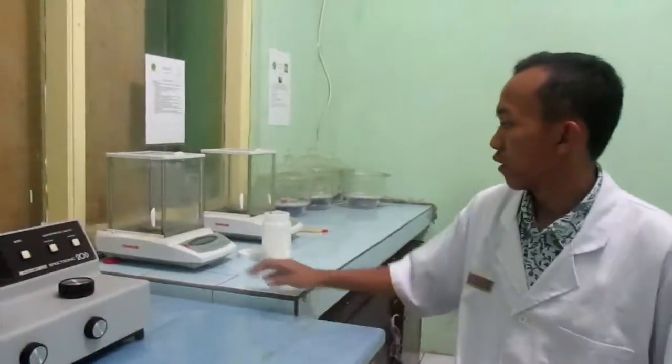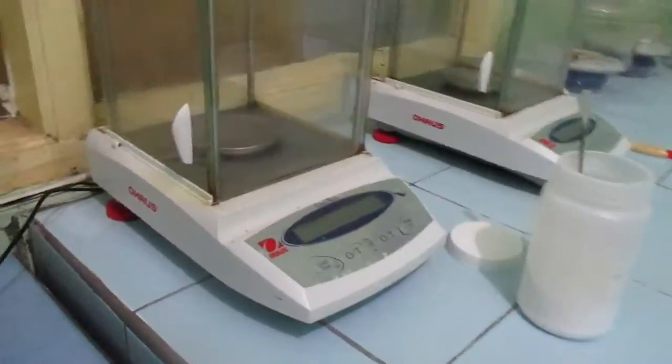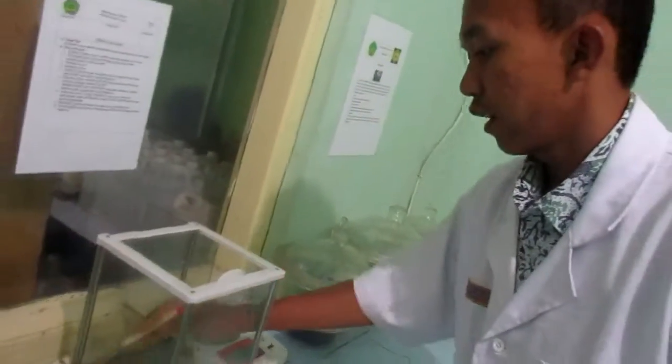In many experiments that you do, there will be a requirement to weigh out the chemical solid or the chemical solution. In order to do this accurately, we will be using the tool called the analytical balance. Before we use the analytical balance, we have to clean it up using a brush — open the glass door and clean it.